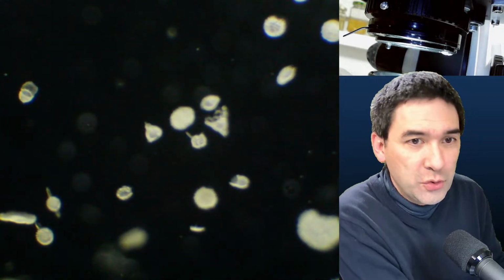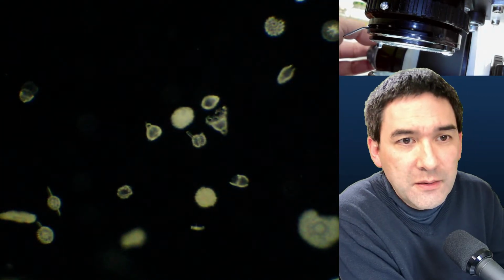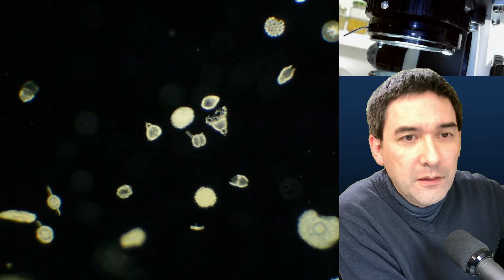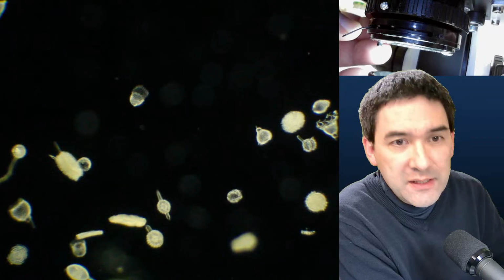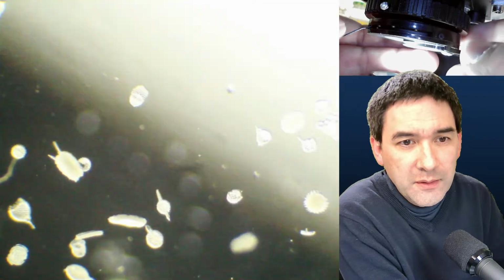So I also want to show you the whole thing now using my 4x. Let's make it a little bit brighter, other direction here. And if you use auto exposure, it's not going to work. Then the forms are going to be overexposed. But what I would like to do now is exchange this, and let's take it out.